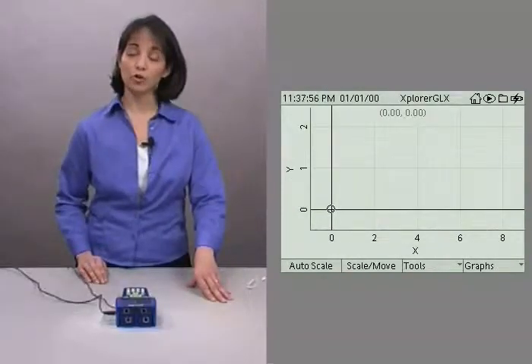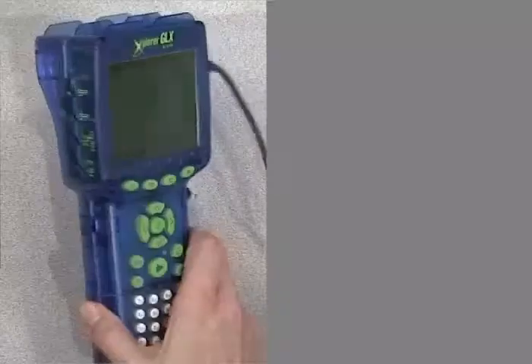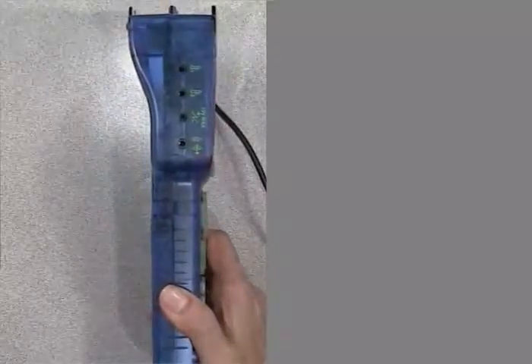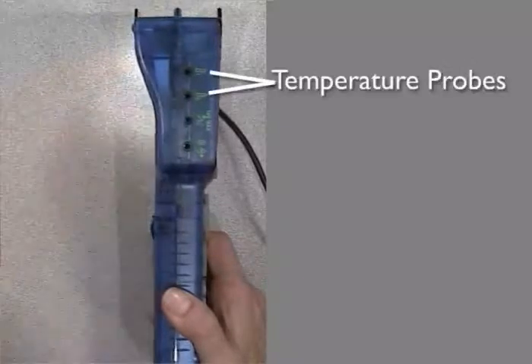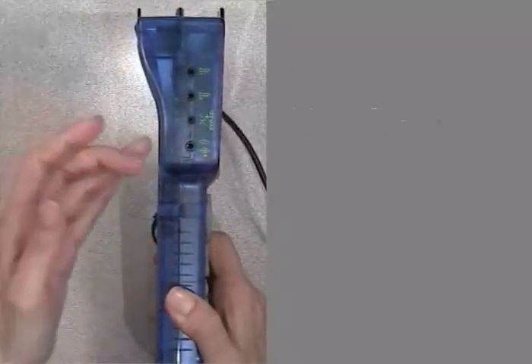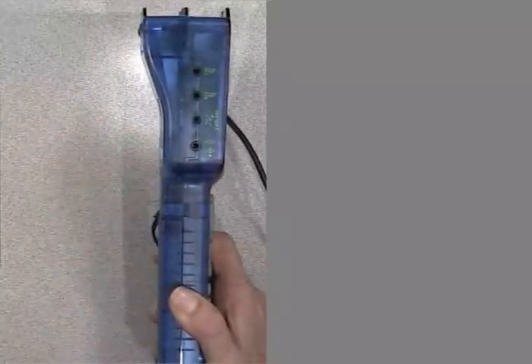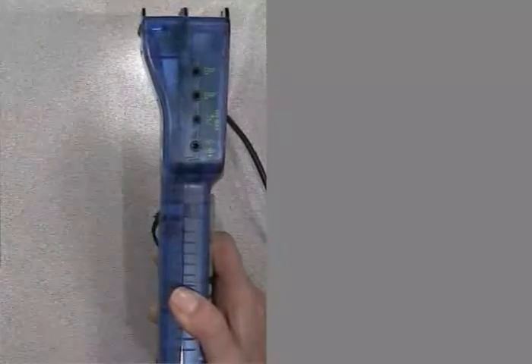Now we're ready to plug in a temperature probe into the left side of the Explorer GLX. You see here that there are four ports. The first two are for the temperature probes. The third one is for your voltage probe. And the last one is for a sound signal output. So go ahead and plug the temperature probe into either of the first two ports.